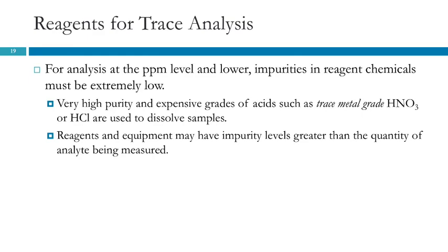What about trace analysis? You guys have been analyzing a lot of water, right? Looking at very, very low concentrations of things, down to parts per million, parts per billion. This is trace analysis. So now the impurities in your reagent chemicals become really important.